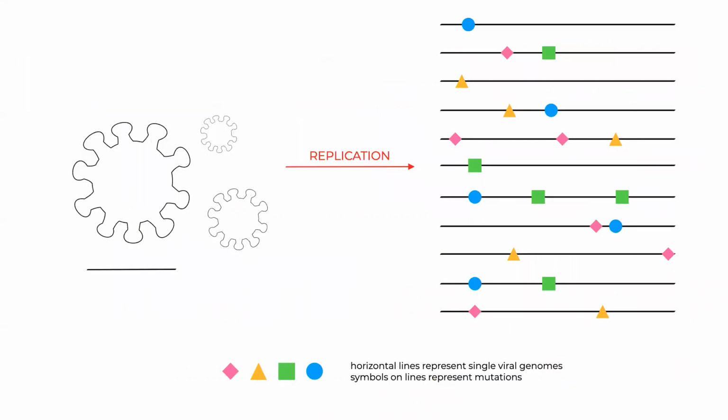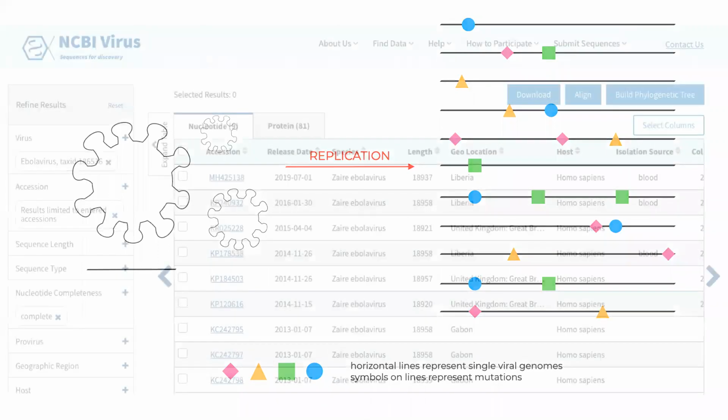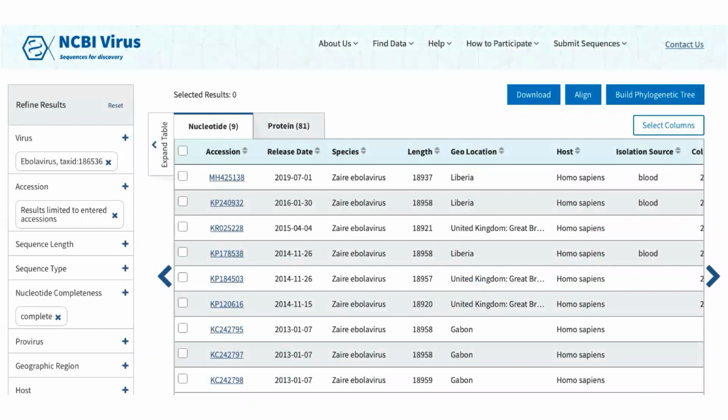So those reads actually represent a number of responses that these different viruses have to different environmental conditions. And we can use those to evaluate, for example, differences between different hosts or differences between different locations. And so we applied that idea to the study of Ebola.